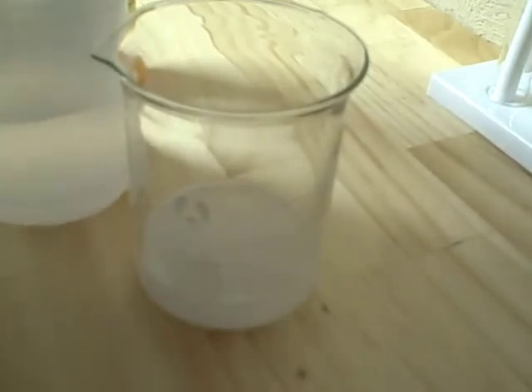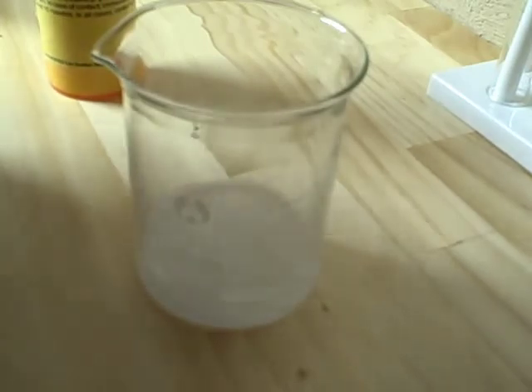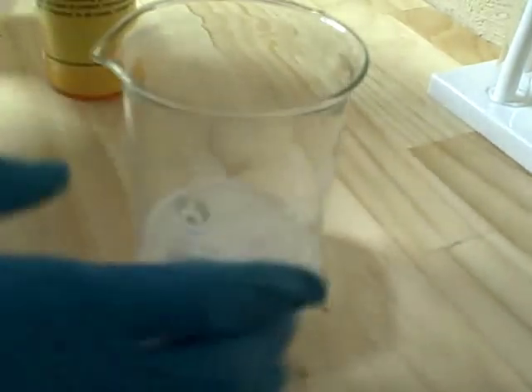It doesn't seem to be foaming much anymore. Now that's clear that we have liquid sodium acetate. However, this is not very pure, so we're going to need to evaporate most of this.